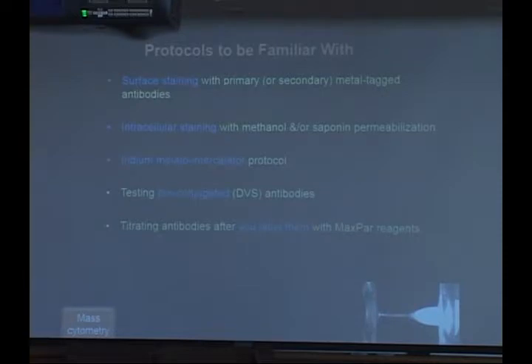And then, of course, after you've done the conjugations yourself, you want to do titrations to see how good your antibodies are. IdU treatment is for looking at the cell cycle, and then cisplatin acts as a nice viability stain. You've probably heard of cisplatin as a horrid chemotherapeutic agent, but this is a cisplatin pulse, and it reacts very rapidly with proteins.